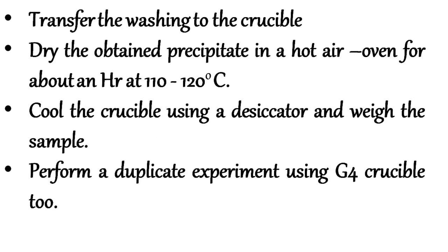Dry the obtained precipitate in a hot air oven for about an hour at 110 to 120 degrees centigrade. Cool the crucible using a desiccator and weigh the precipitate. Perform a duplicate experiment using a G4 crucible too.